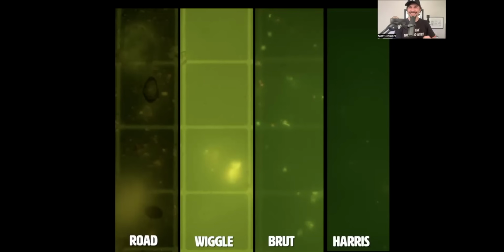I'm giving away all my secrets here, but this is going to be a standard that you're going to see, and you're going to see people show this, and they're going to be like, look, we have the standard or the guide in the first bracket, and then the second bracket is where you were 2 weeks ago when I first tested. And then the second bracket is I tested today.